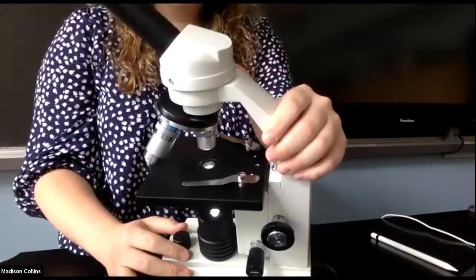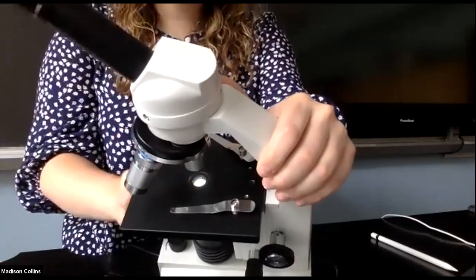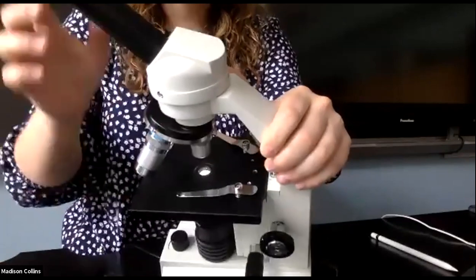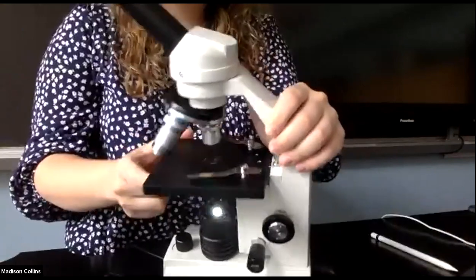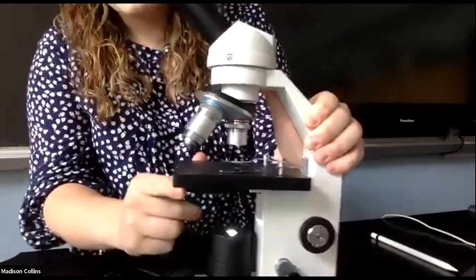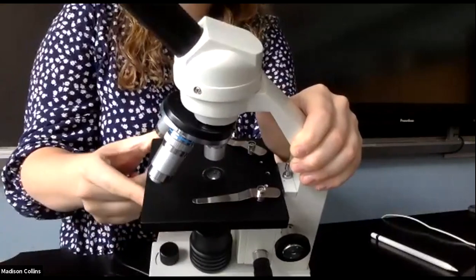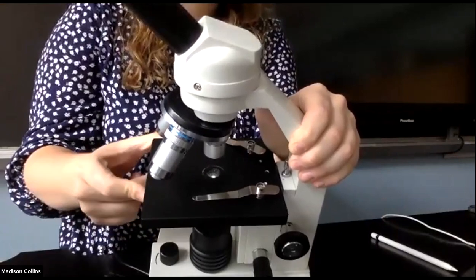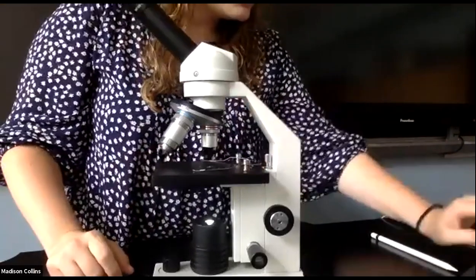But what actually allows that light to come through is this little circle right here. So on the stage, there's a portion in the center that is clear that allows that light to shine through, so that we are able to see it. But you can control the amount of light that comes through by rotating this disc right here. That's called the diaphragm. If you watch this center right here, you can see changing the diaphragm changes how much light comes through that circle. All right, so this is our diaphragm. Okay, let's see what's next.